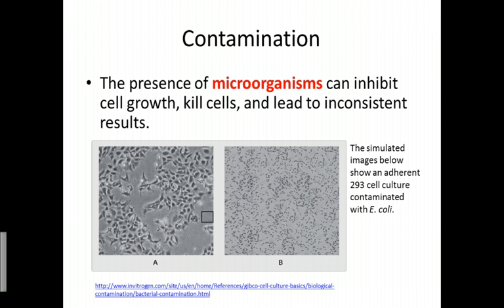inconsistent results and performance. So this is the diagram where, when you observe the cells under the microscope, under high magnification, you will see there's a lot of rod-shaped bacterial cells, observed in diagram B, where it is contaminated with E. coli.